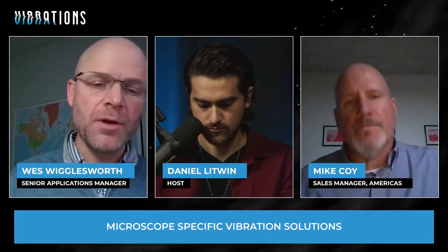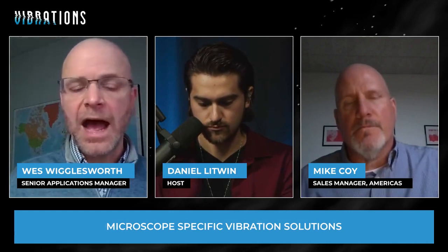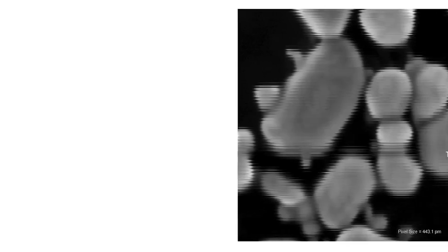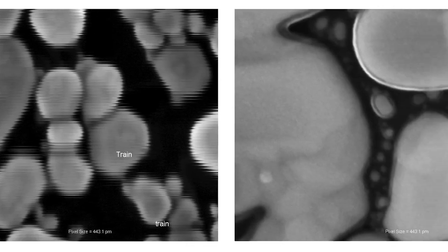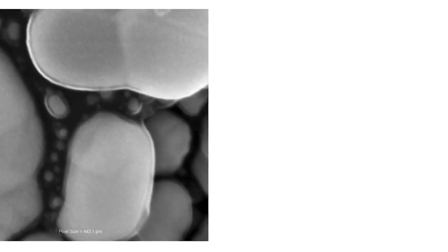As Mike mentioned earlier, maybe a second floor or even a third floor and higher. The internal vibration isolation system of the microscope does its job, but it's not going to cancel the very low frequency building vibration. And that's the external vibration coming from machines in the building, traffic outside, foot traffic, that the external base under the microscope mitigates.